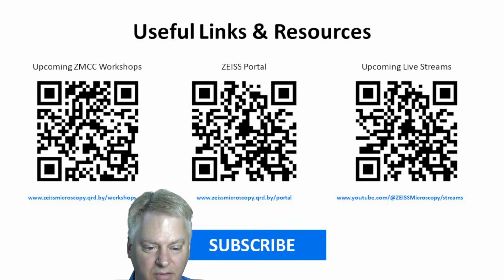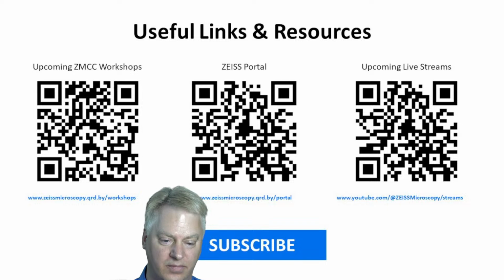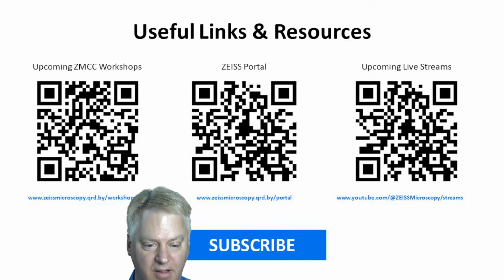Breskin is asking, is ZenCore a direct replacement for Atlas? ZenCore does most of what Atlas does. So yes, in a way, Atlas just has finer control on some things that are more complicated, but for like 90% of what you might need, ZEISS has shifted to ZenCore EM, including the ZenConnect and the Zen automated imaging. So the automated imaging is what's equivalent to Atlas 5. So you're correct on that.